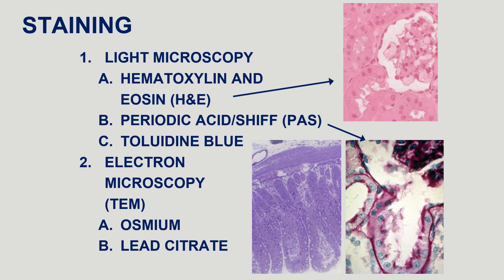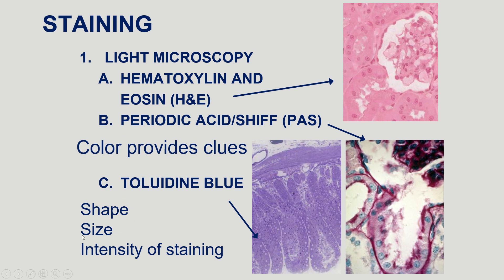Our next stain is the PAS stain, or Periodic Acid-Schiff stain, which stains carbohydrates and sugars. Sugar-rich parts of the cell — the plasma membrane and basement membrane — stain a bright magenta-purple color. The next stain is toluidine blue, where everything is blue; it's the change in intensity that clues you in on what's going on. In all of these stains you also use the shape, size, orientation, and intensity to interpret what you're looking at.